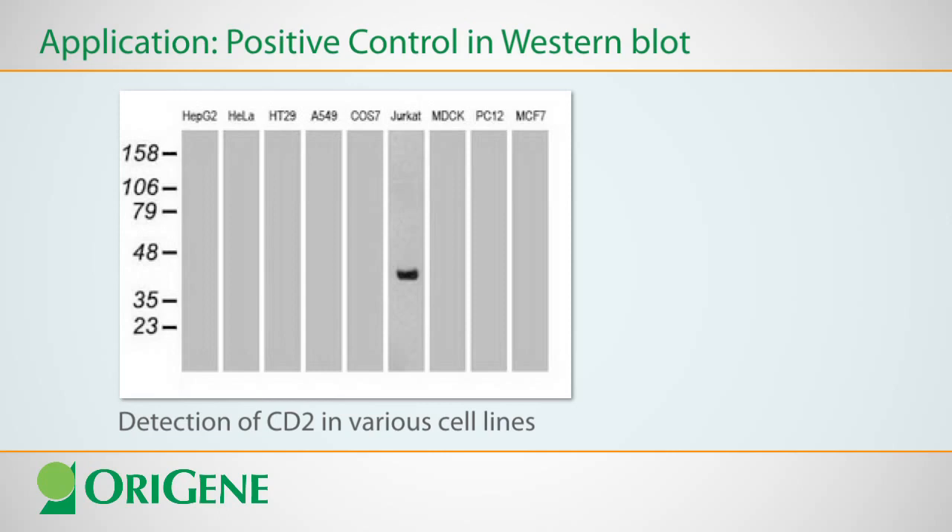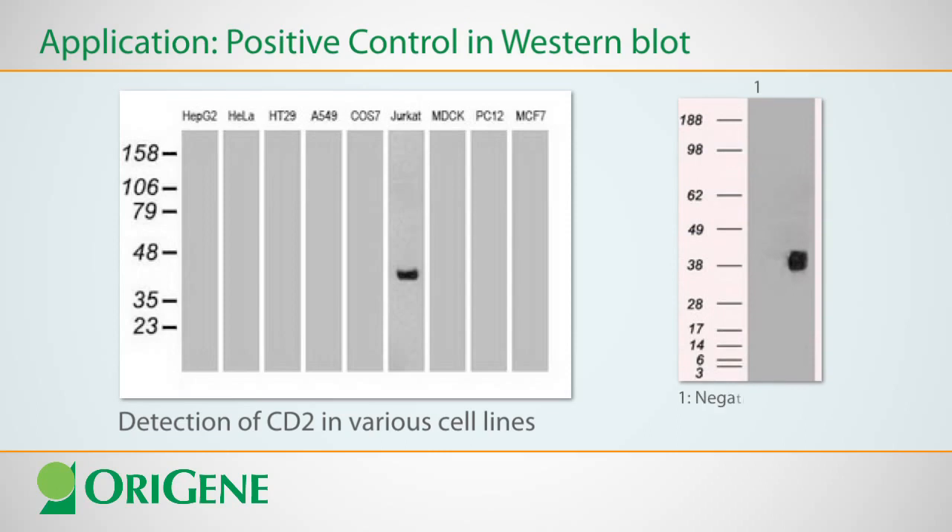This raises the question of nonspecific antibody binding to another protein in Jurkat cells that may not be CD2. If a lane of CD2 overexpression lysate is included in this blot, a band of appropriate molecular weight would confirm the antibody indeed detects CD2.